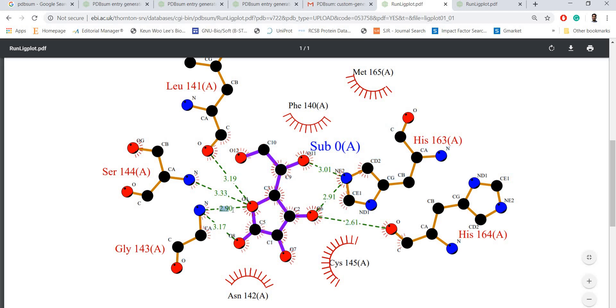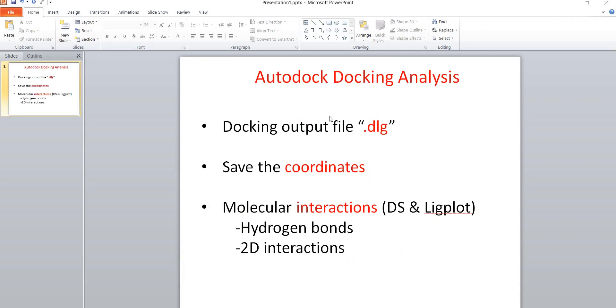These values are the distance between the acceptor and donor atoms for your hydrogen bonds. That's all for your Autodock docking analysis.